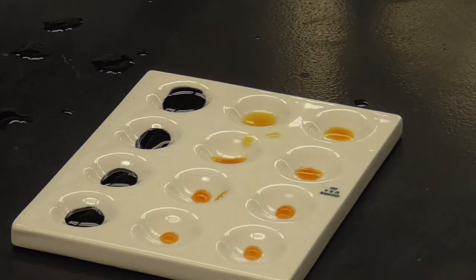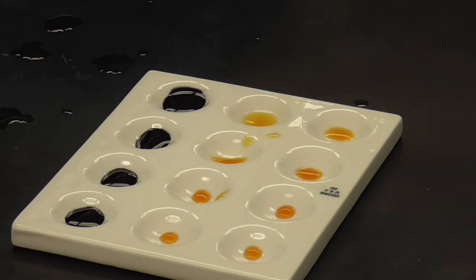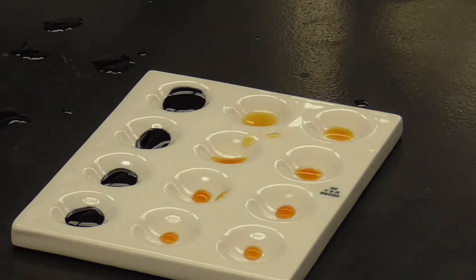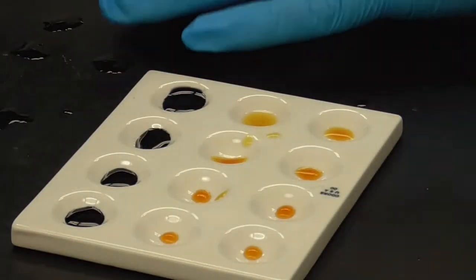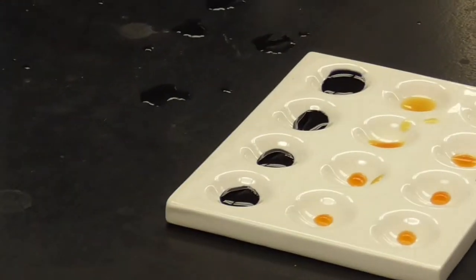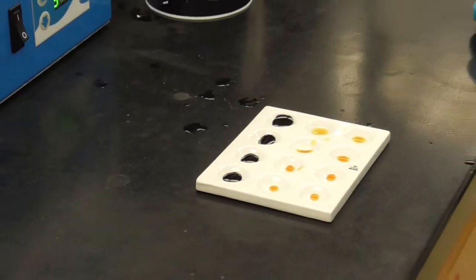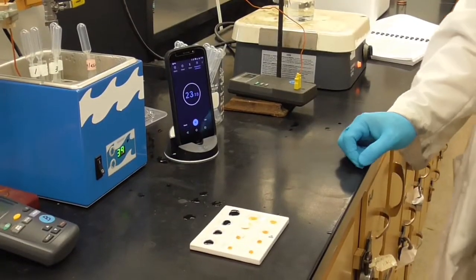And you know what, I just realized the procedure says, after you do that, in 5 minutes, test it again. So let's get my stopwatch going. Here we go, and I will put that up here. Of course, it probably took me about 30 seconds to do those drops. I'm going to stand so we can see the timer. That probably took me about a half a minute when I added it, and then I put it down there. So for 5 minutes, we'll do it at 4 minutes and 30 seconds. I think that'll be about the same.